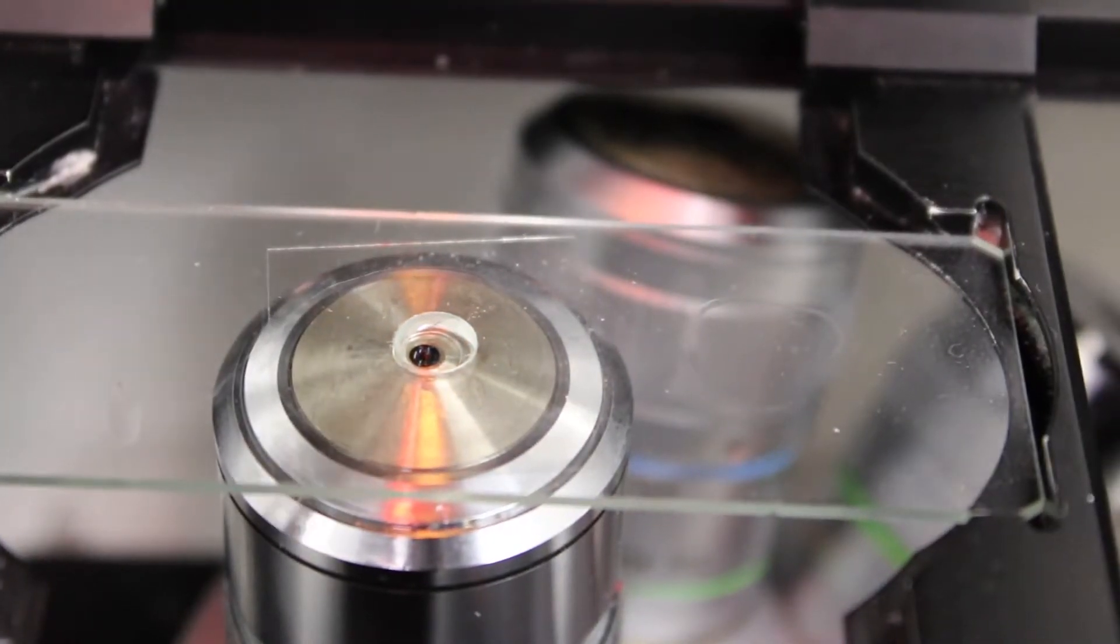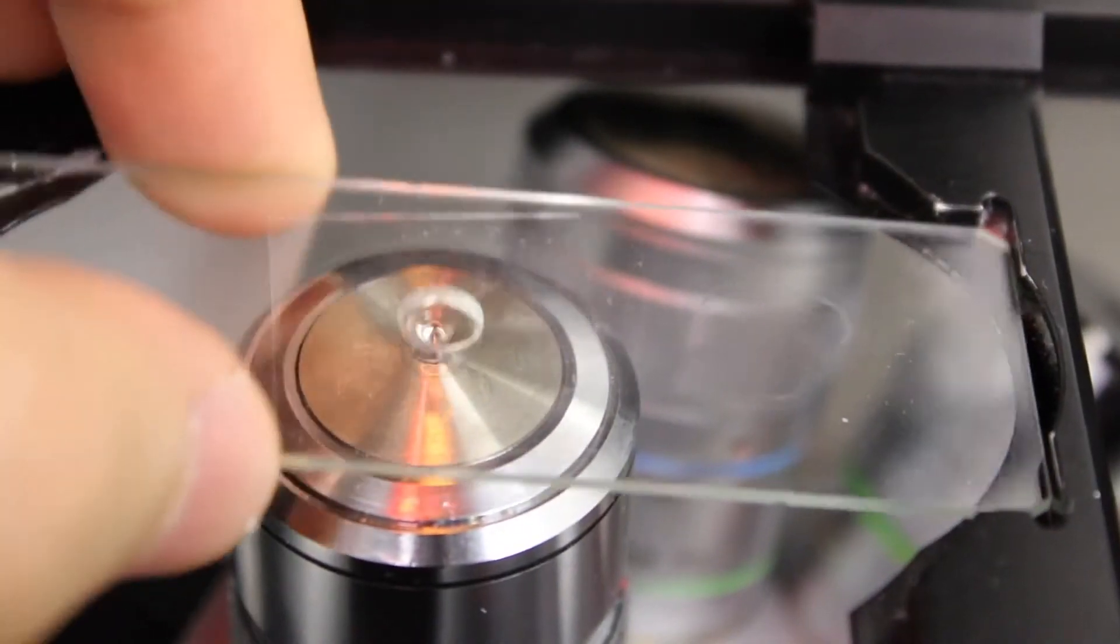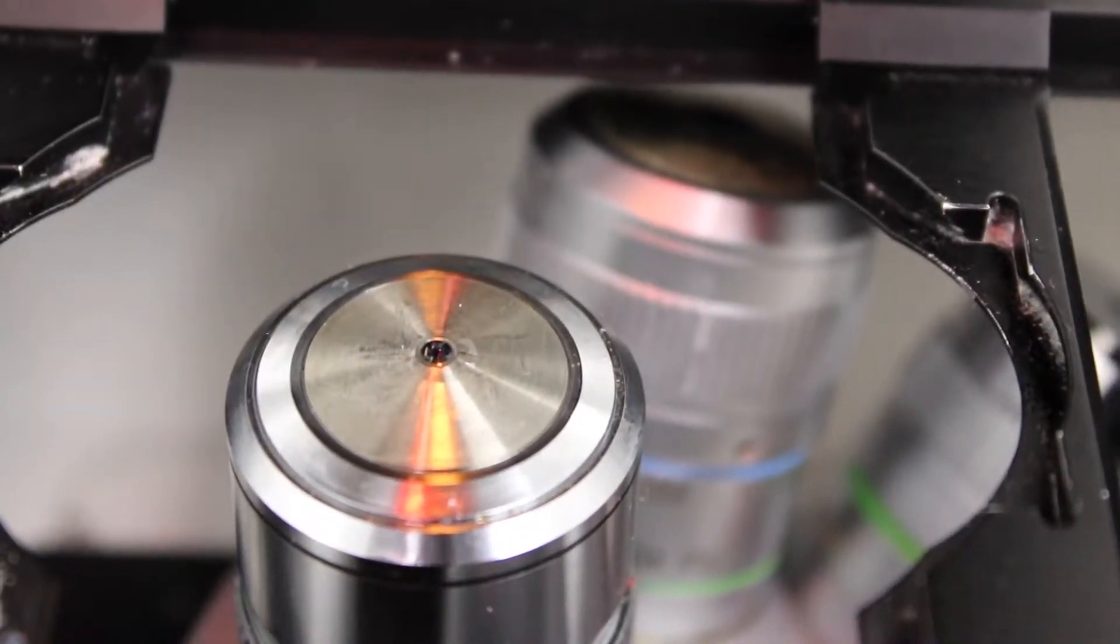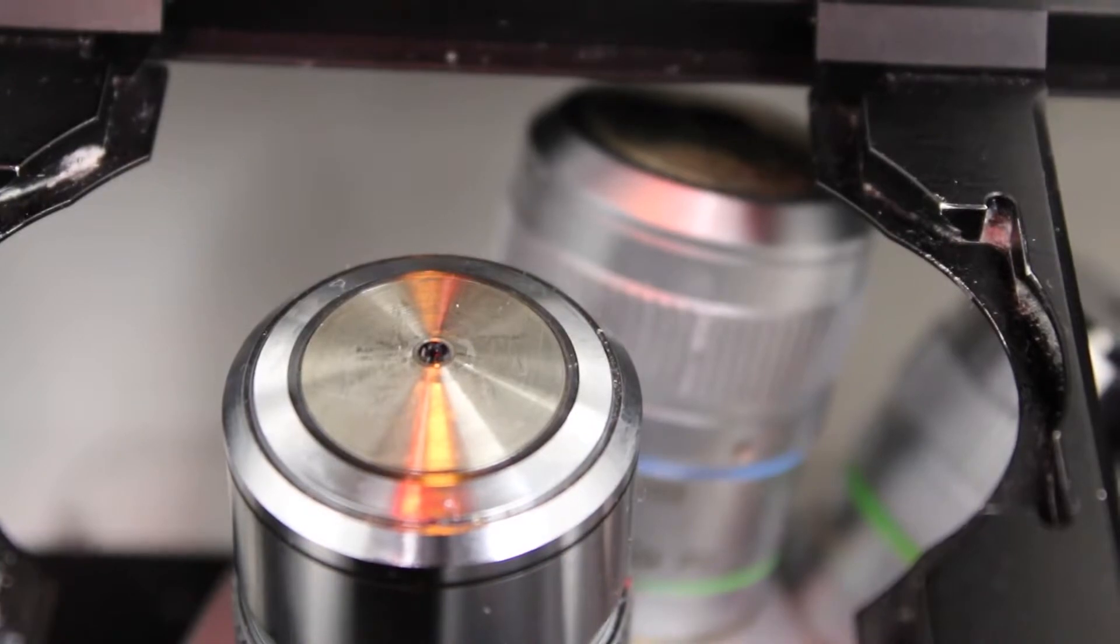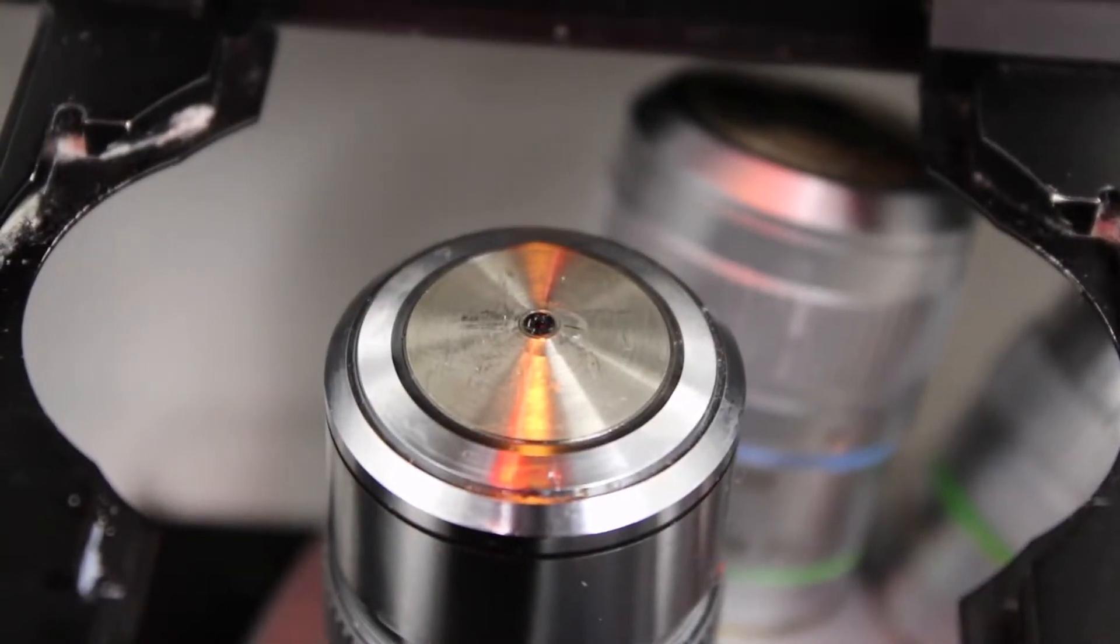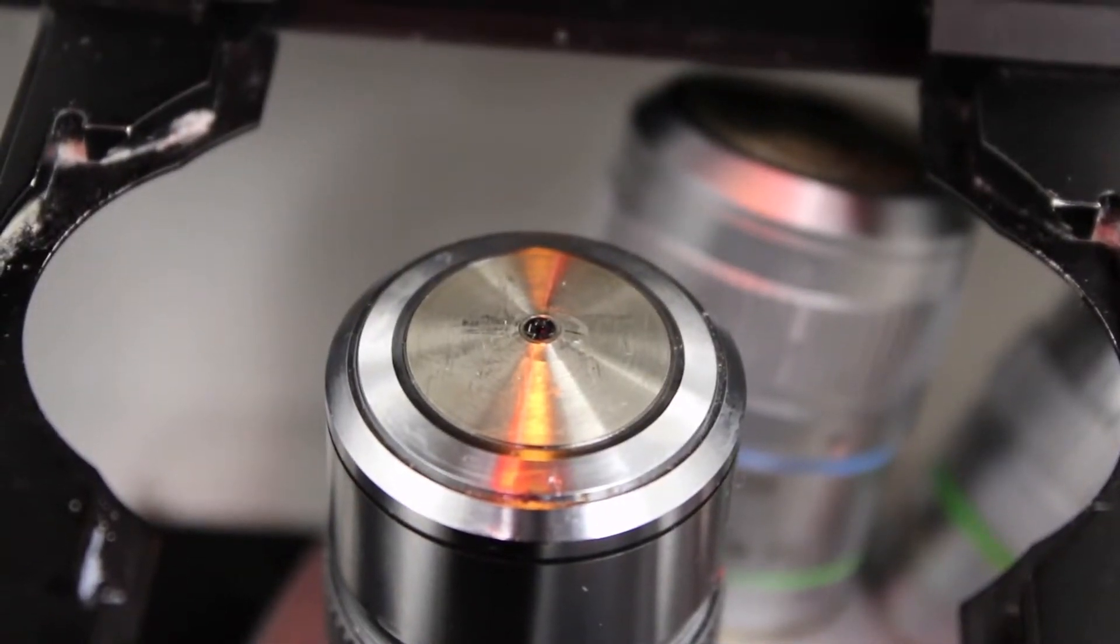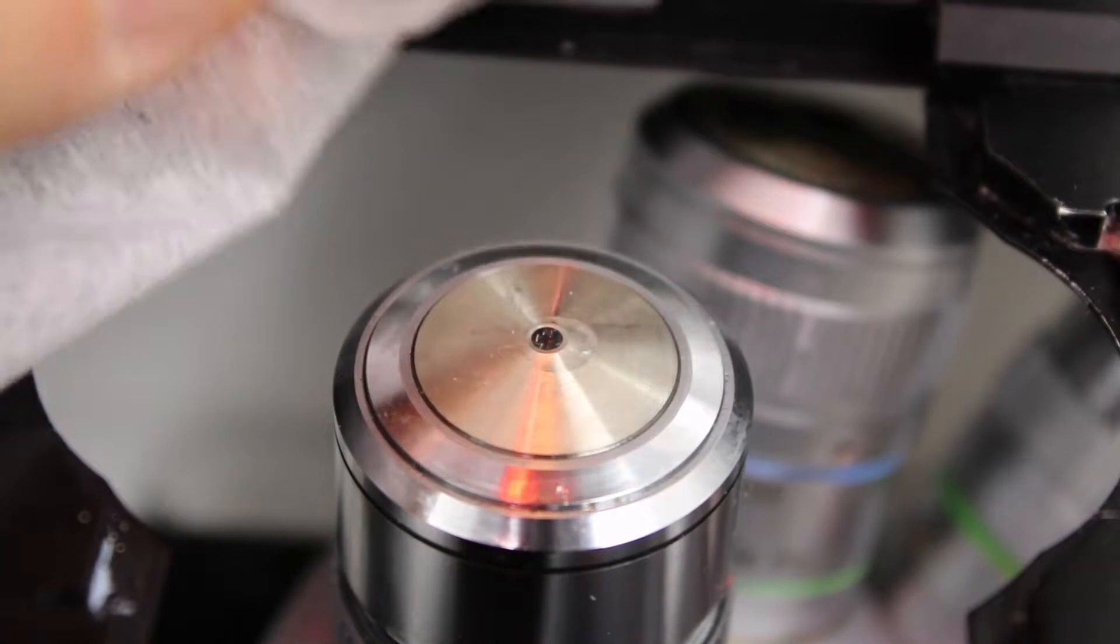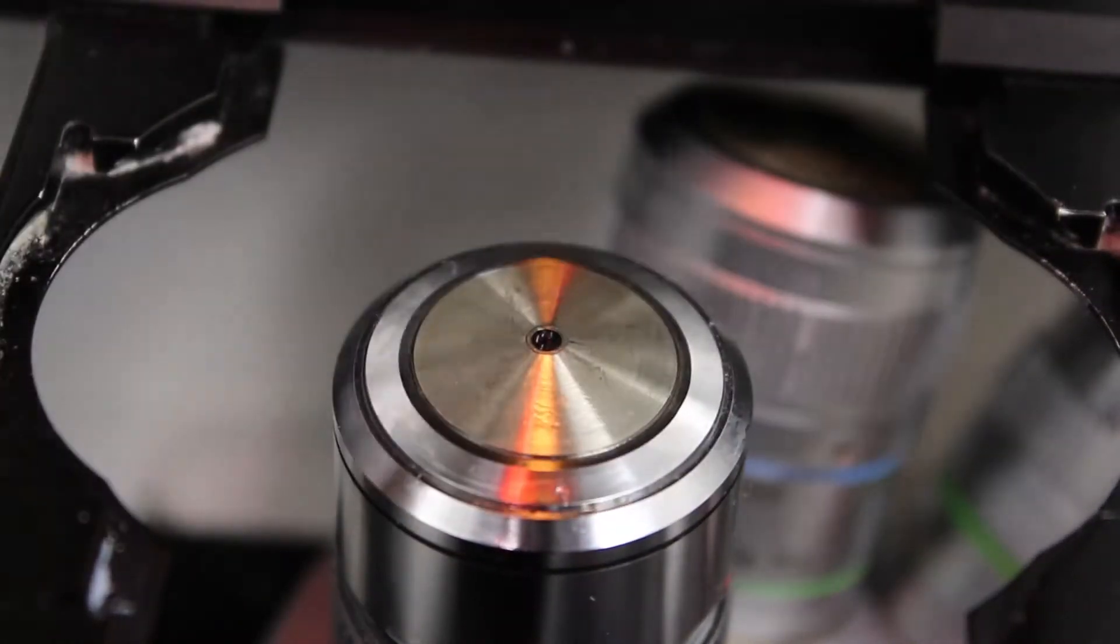When you're done using the immersion objective, you should again remove the sample, and then you should clean the objective. We're using lens cleaning tissues, so you take one, and then you just wipe, like this, the oil off, like two or three times, to make sure that all the oil has been removed.